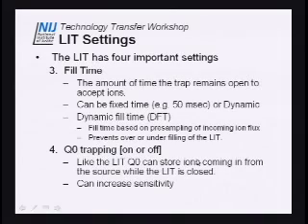Unfortunately, if you set it to dynamic fill time, what you cannot do is the next thing at the bottom of our list here, called Q0 trapping. The Q0, that very first quadrupole that's used to focus ions out as they come in from the source, can actually store ions all by itself. It's too far from the detector to do anything, but it can store ions.